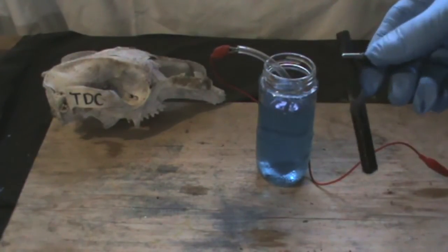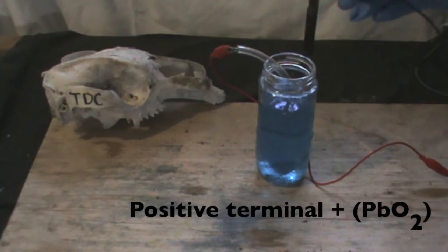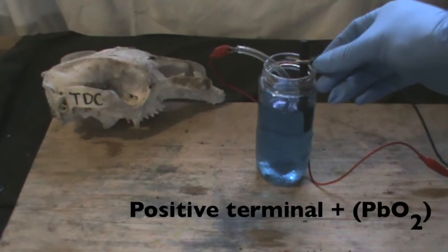Next, get the lead dioxide electrode and clip it onto the positive terminal of the power supply. This is the anode.